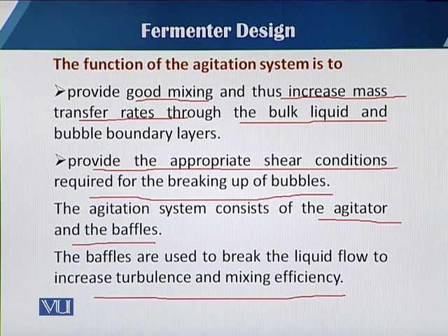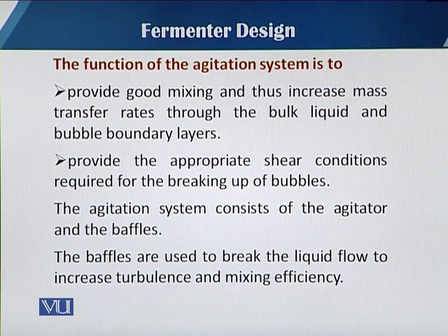There will be a continuous layering of the medium. The medium on the periphery remains on the periphery, and the medium in the center remains in the center. Baffles give the medium an equal chance to come in contact from the outside to the inside and inside to outside. That is only due to the increase in turbulence.